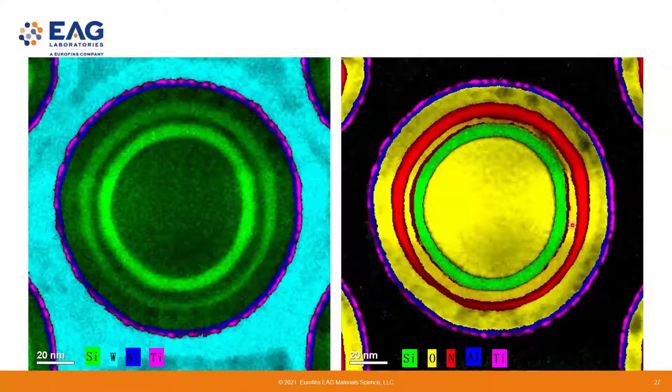nitride, and then there's oxide, a very complicated layer. And I believe this silicon nitride layer is used for information storage, right? So basically your electrons are stored here in this tiny layer.